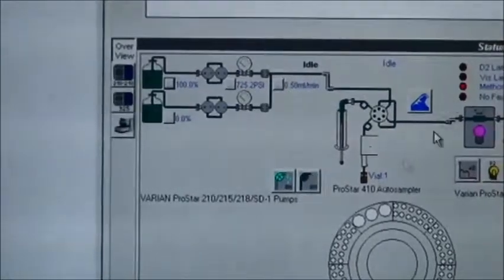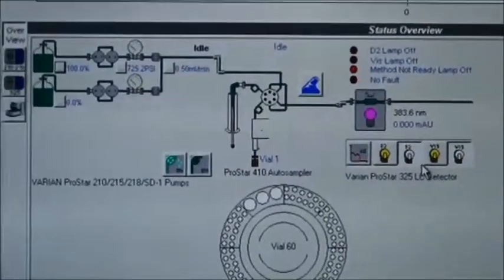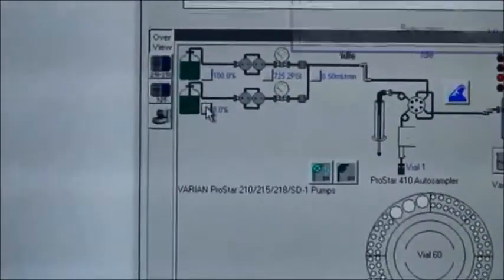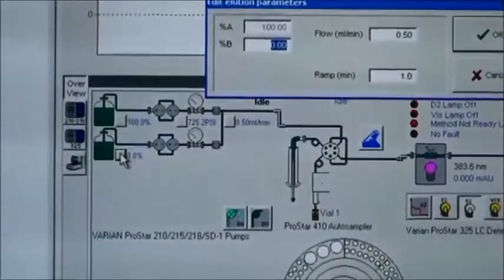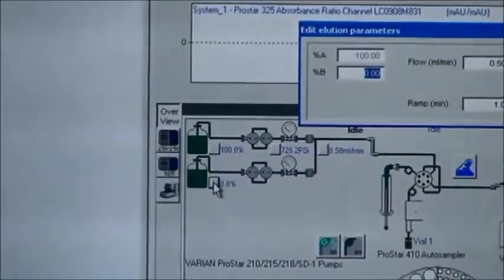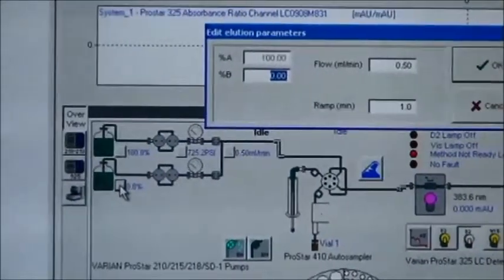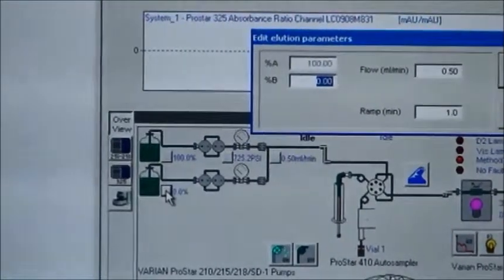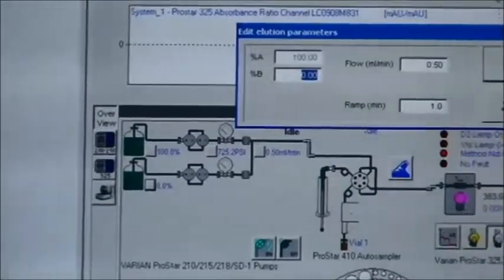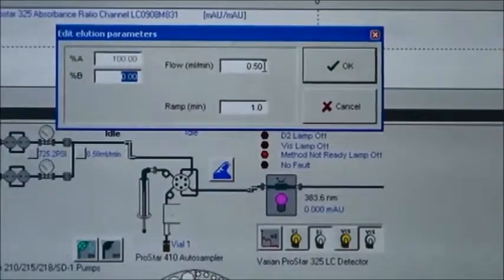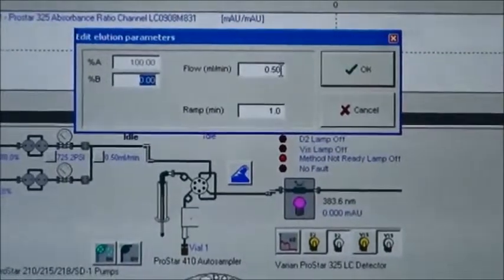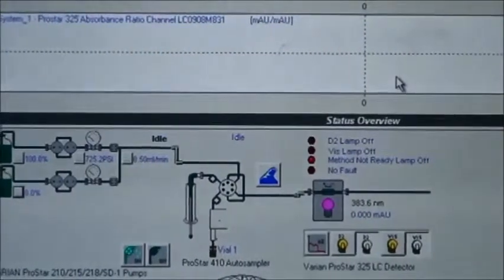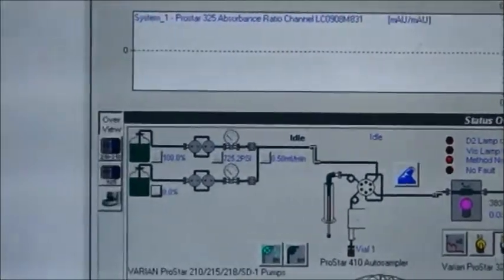To start, you first turn on the pump because you want the solvent to run through the system. Normally we turn it on and let it run for about 30 minutes to get rid of all air bubbles or any inconsistencies in the flow — we want a very consistent flow without any air bubbles. You set the rate at which you want it to run, which is set here to 0.50 milliliters per minute, then click OK. Like I said, you turn it on and let it run for about 30 minutes.